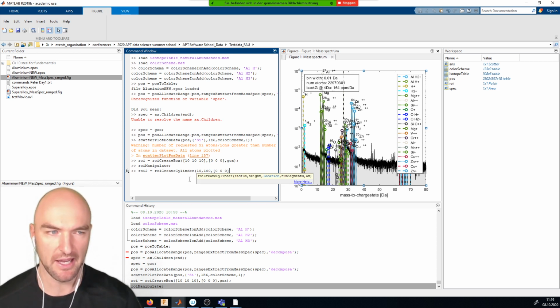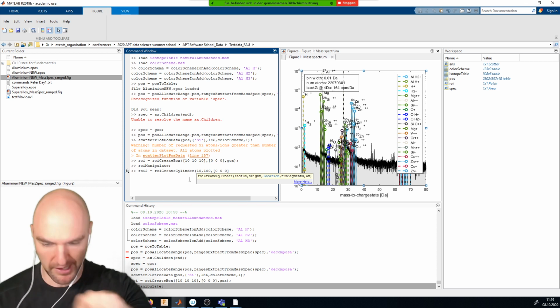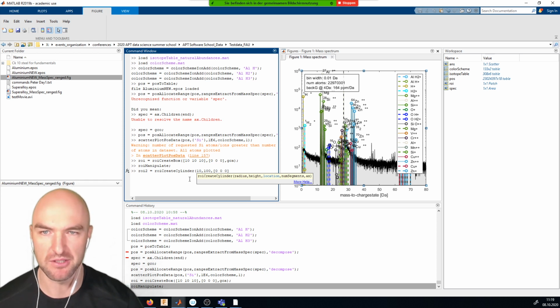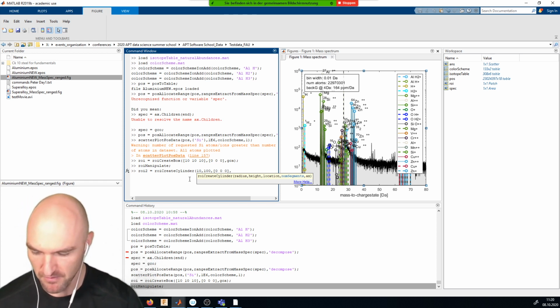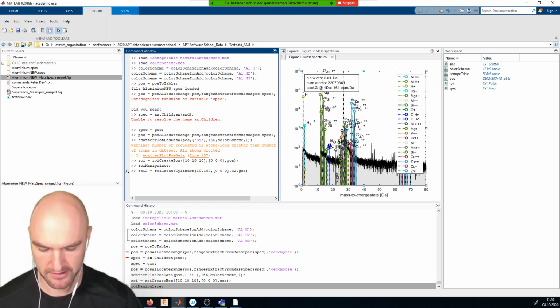In this case, we need to say how many segments we want to have, because it's not a cylinder in the sense of an infinitely smooth cylinder shape, but it will have segments. And this is very important because it has big implications on the performance of the containment test. Containment test means it's a test for the way for us to find out what's inside the region of interest. And usually, 16 or 32 segments is a pretty good number, and we're using the current axis.